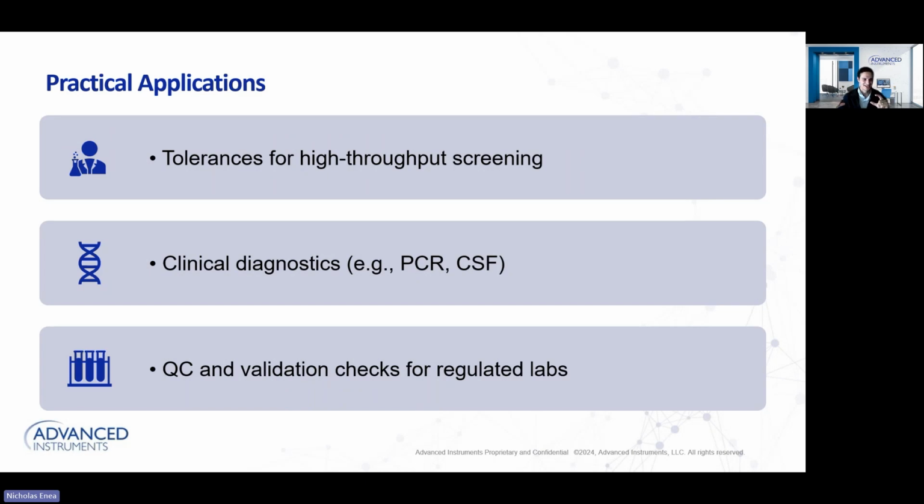As a former genomic scientist working on next generation sequencing, doing library prep, our assay tolerances for some of our additions were very, very tight. We're talking less than 1% that could throw off my whole assay data. But when I was working in the IVD world, it wouldn't matter if I was 5 to 10% off with my antibody concentration. So be very mindful of the application that you're working in, and set the tolerance from a data-driven perspective, not just relying on external sources.